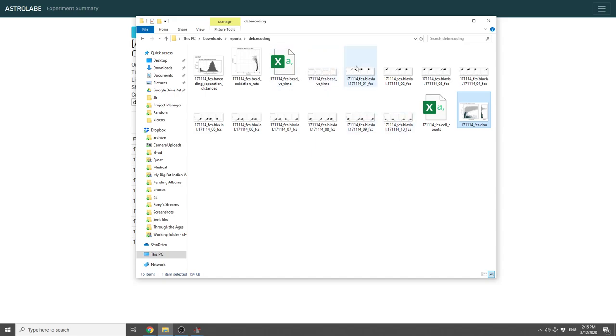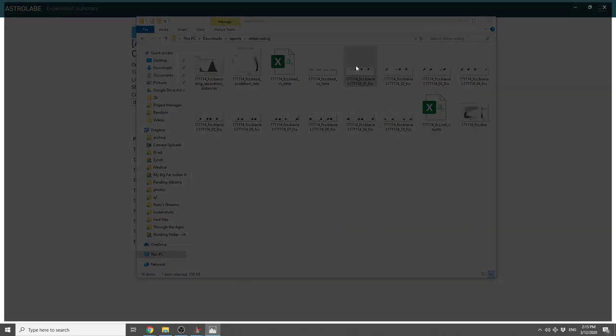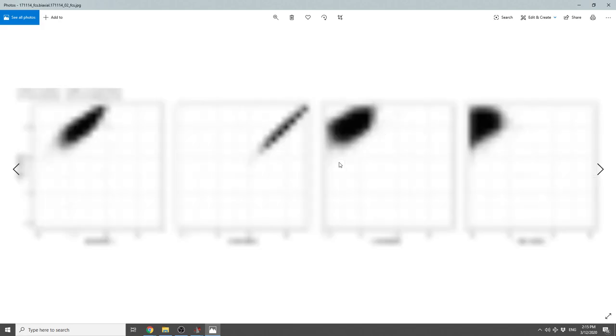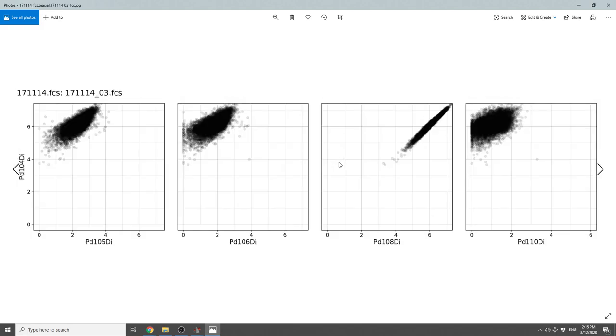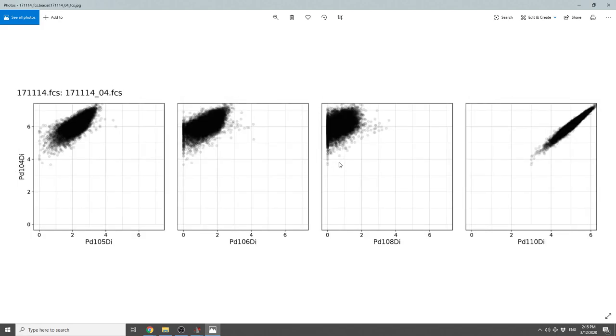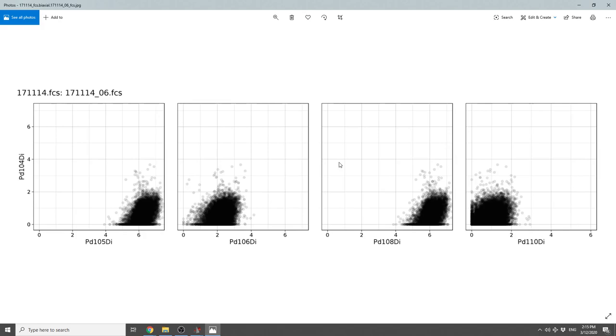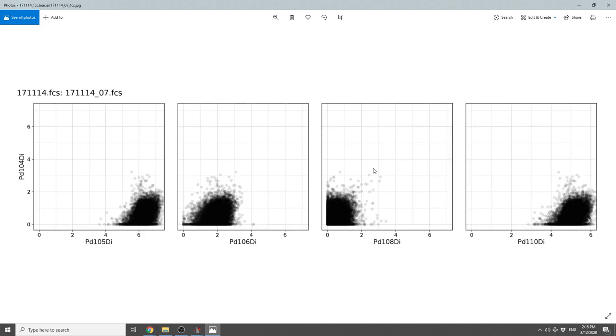Then, for each one of the codes, it will show you the marker combination for that code. So we can go sample by sample and make sure that the positions of the cells are indeed clean across the different biaxial plots.